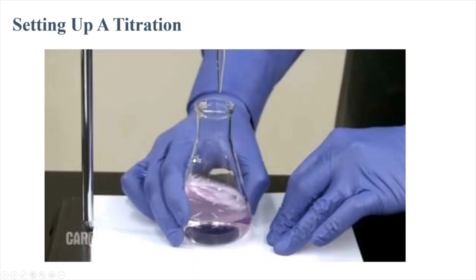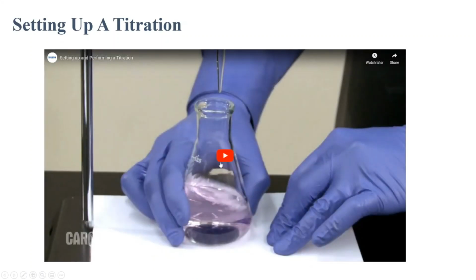Okay, so now let's take a look at this video, which is going to go through and show us all the steps of setting up and performing a titration. This video is from Carolina, and they do a really good job of explaining how to do a titration. We actually use Carolina burettes at Fordham, so this video will show you exactly how to do a titration.